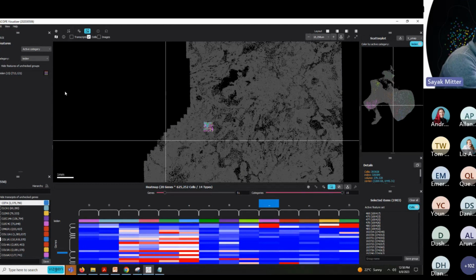Select custom cell groups based on predefined analysis parameters, such as that. Yeah, so that is a workflow that I'm not completely sure, Maureen, if I have the answer right now, but I will research that a little bit and get back to you.